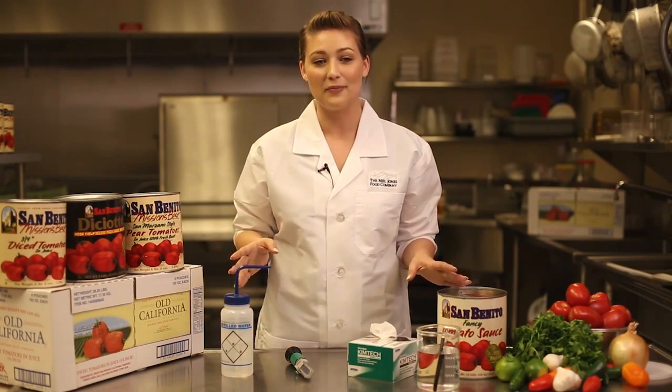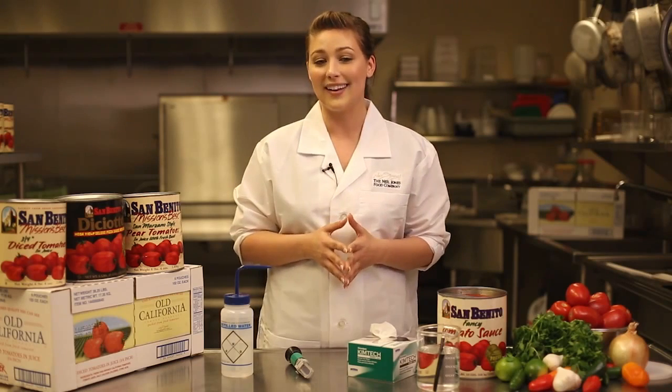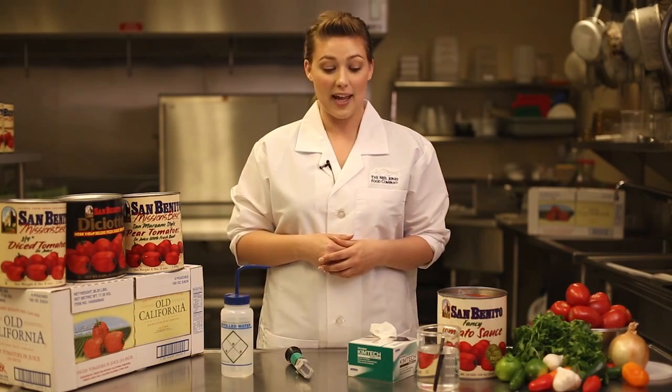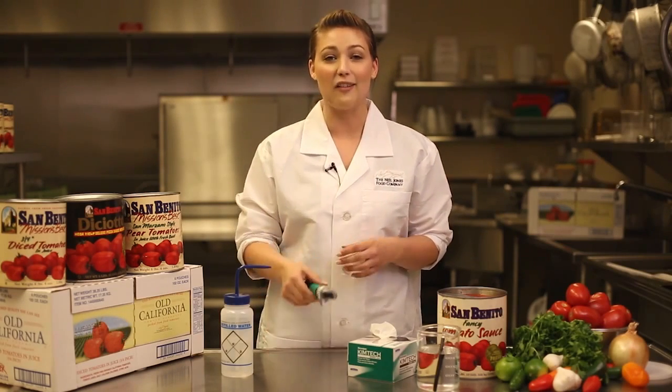Restaurant operators generally have a specific sweetness level that they target for various applications. We measure BRIX using a refractometer. Today I'm going to discuss with you what that is, how to properly use it, the types of products it can be used with, and how to properly take care of it. Today we're going to be talking about the handheld analog unit.